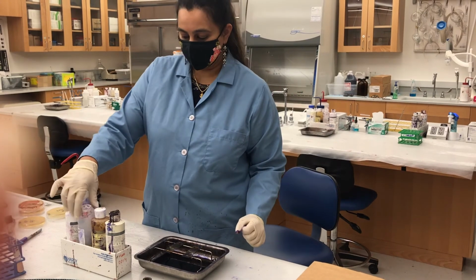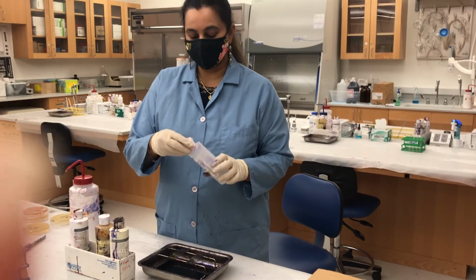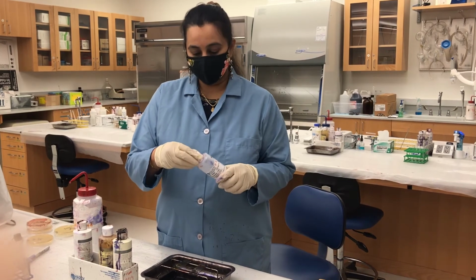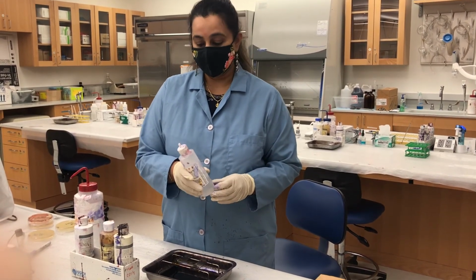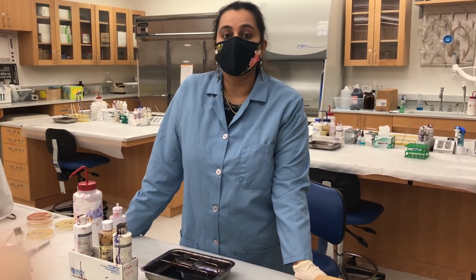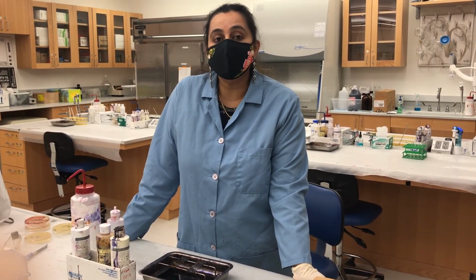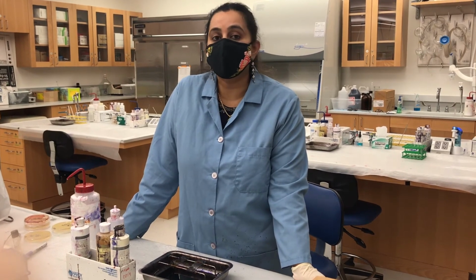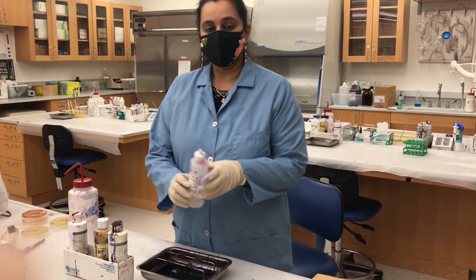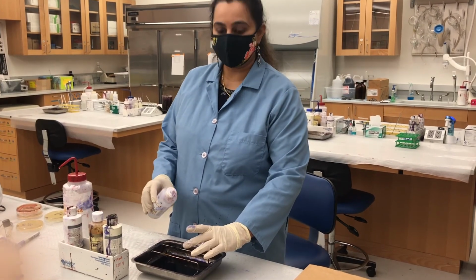Right, now the most critical step. In the gram staining technique, this is really an important step: using the decolorizer. The decolorizer should be used only for a very brief period of 8 seconds, just to wash off the primary stain from the gram-negative cells and not from the gram-positive cells. What will happen if you use the decolorizer for a long time? The stain from the gram-positives and gram-negatives would all come off, and you don't want that to happen. So use your timer and be very specific to use the decolorizer for only 8 seconds.